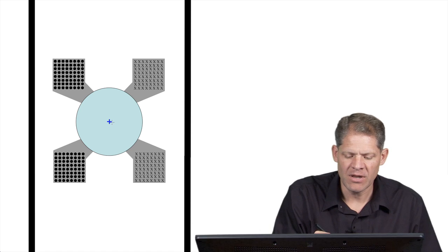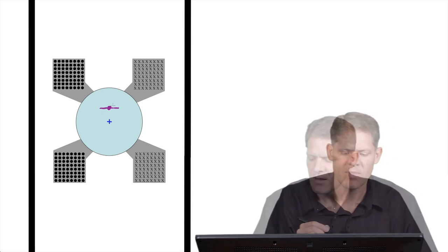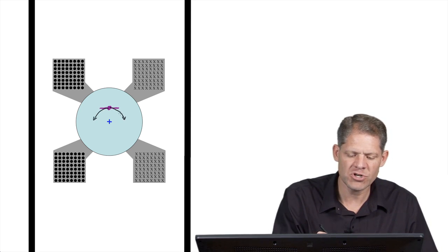Now what would happen if instead of having the sample right here along the axis of rotation, our sample were higher than that? So here was our target of interest. Now imagine that we rotated this. The sample would then go through a trajectory like this around the axis of rotation.